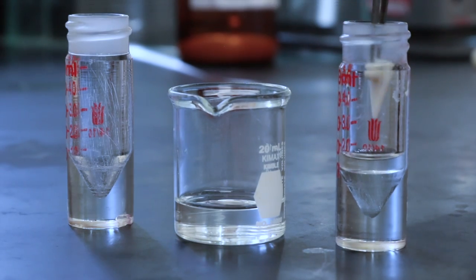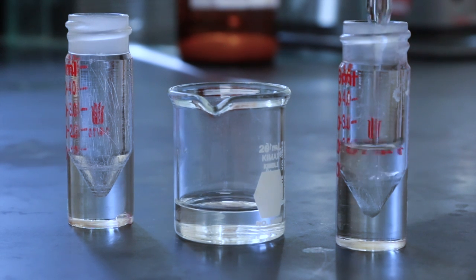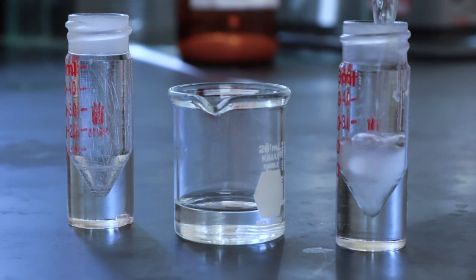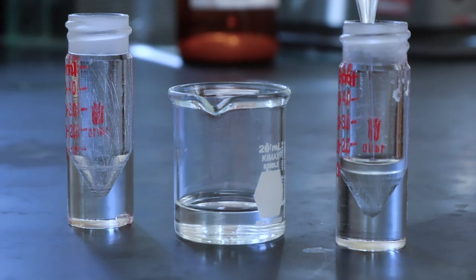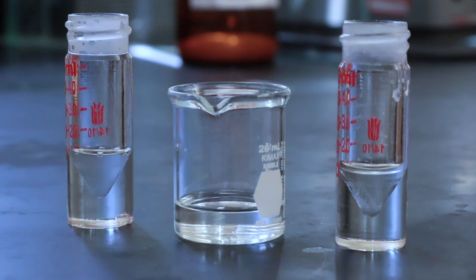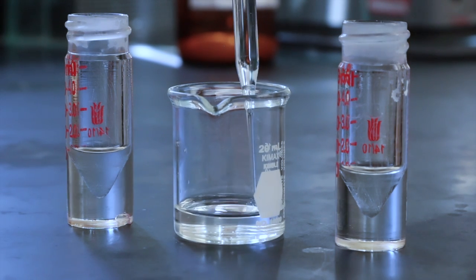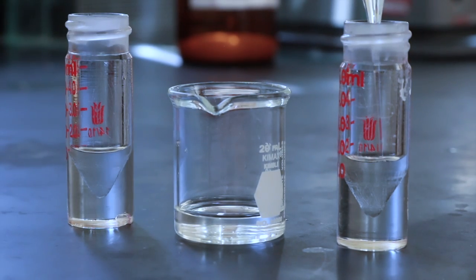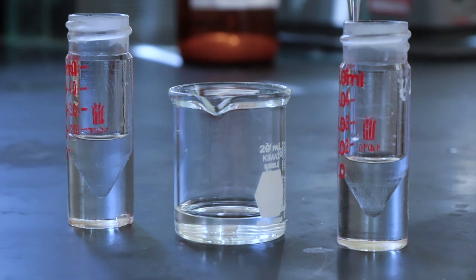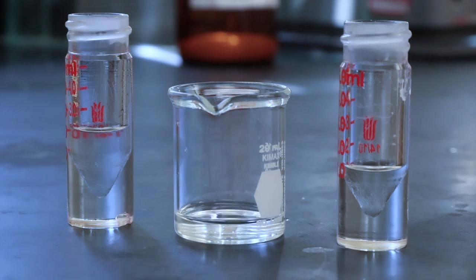I'll remove the spin vane and then add a little bit of ether just so we can see the organic layer a little bit better while doing these extractions. Then I can remove the organic layer on top containing our organic product and then repeat this process 2 more times. It was really difficult to see the separation of the 2 layers, so it's very possible I got some water in there, but that's what drying with sodium sulfate is for, right?